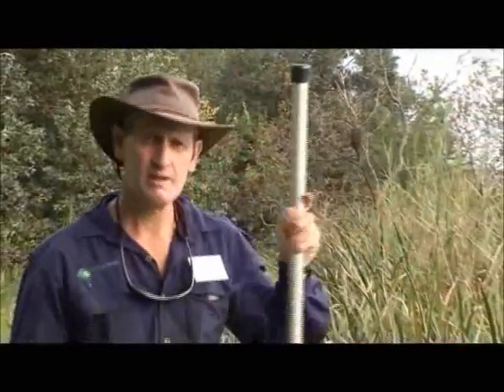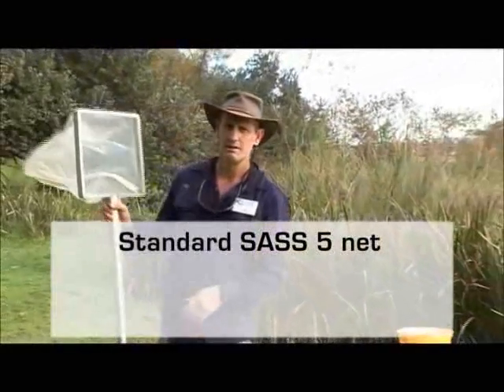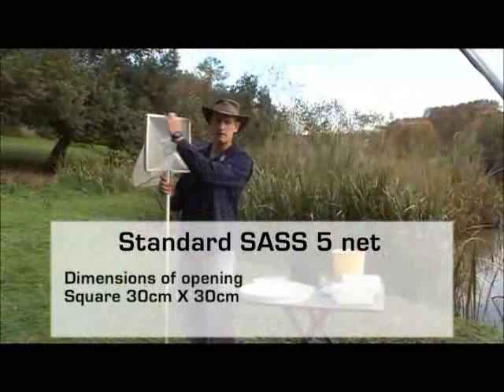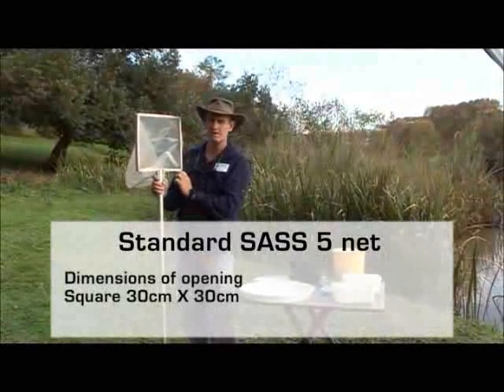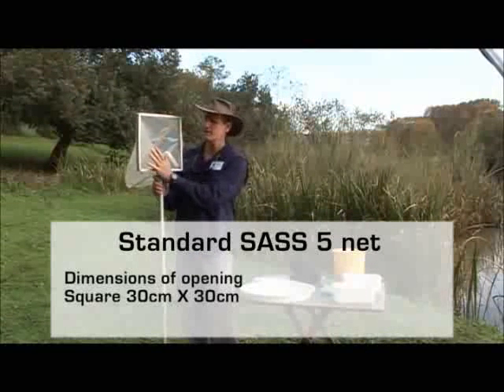First thing, we need a net. Now the standard SASS5 net is very strictly defined. It's a square opening. It's 30 by 30 centimeters each side. Beyond that, the opening is defined.